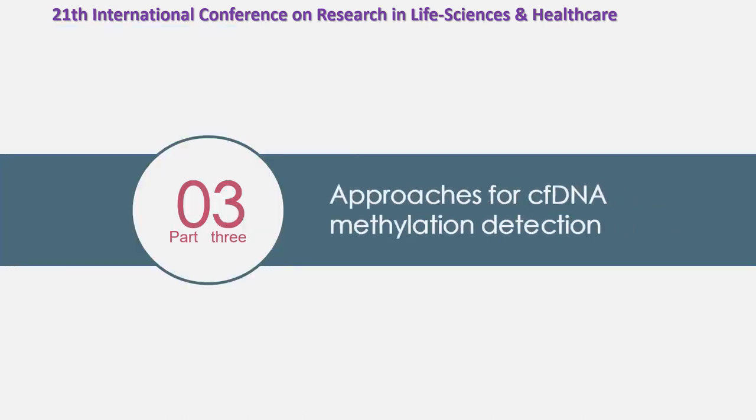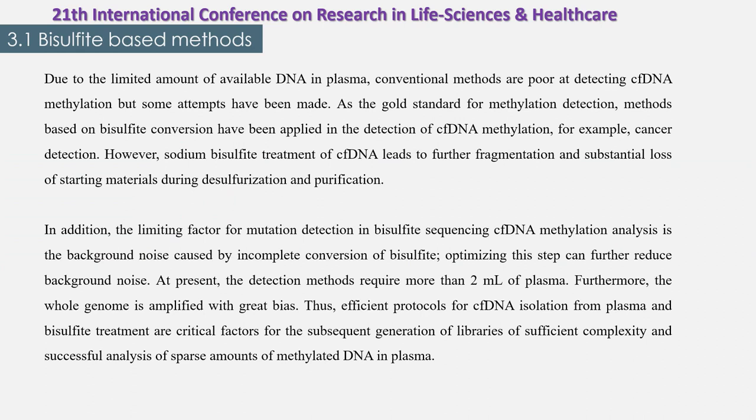As for the approaches for cell-free DNA methylation detection, they mainly focus on bisulfite-based methods and MeDIP-based methods. Due to the limited amount of available DNA in plasma, conventional methods are poor at detecting cell-free DNA methylation, but some attempts have been made.